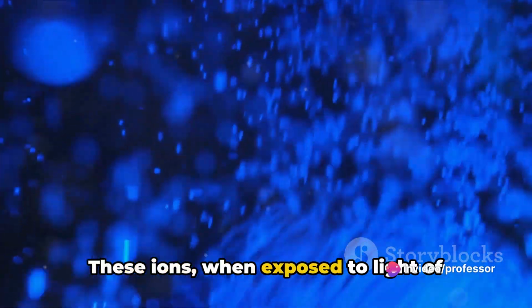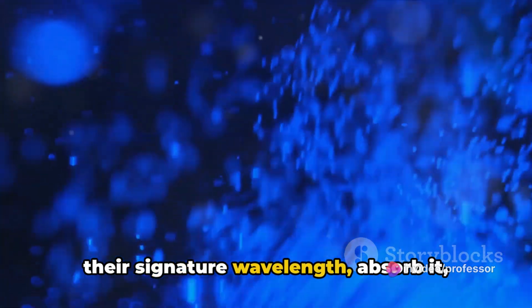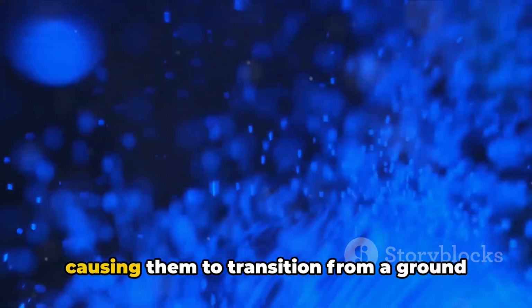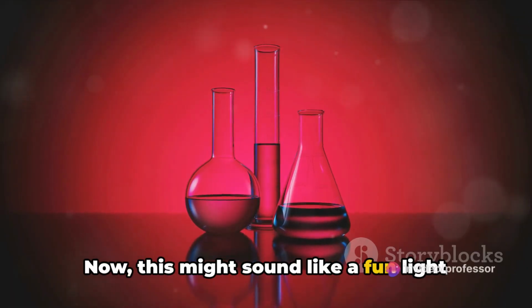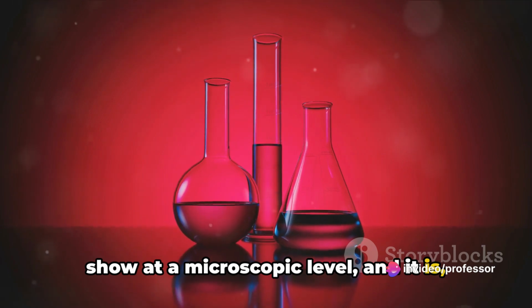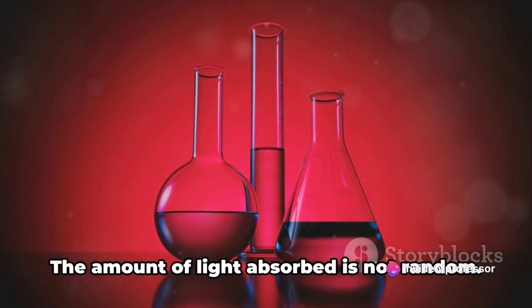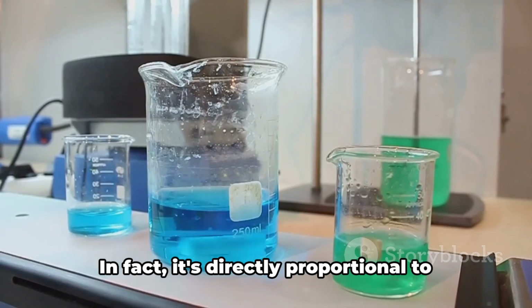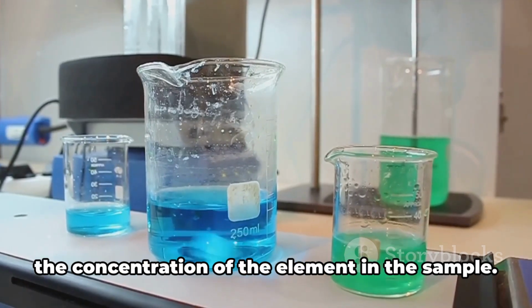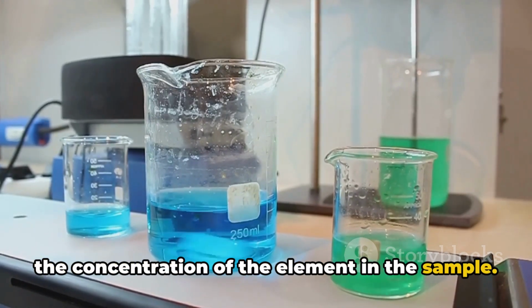These ions, when exposed to light of their signature wavelength, absorb it, causing them to transition from a ground state to an excited state. Now, this might sound like a fun light show at a microscopic level, and it is, but there's more to it. The amount of light absorbed is not random. In fact, it's directly proportional to the concentration of the element in the sample.